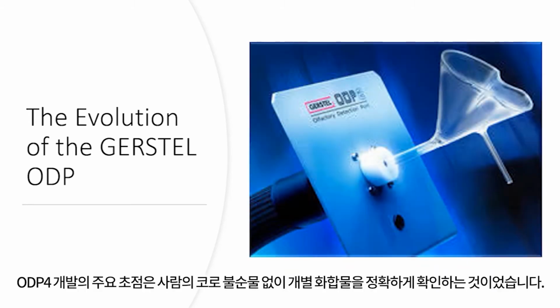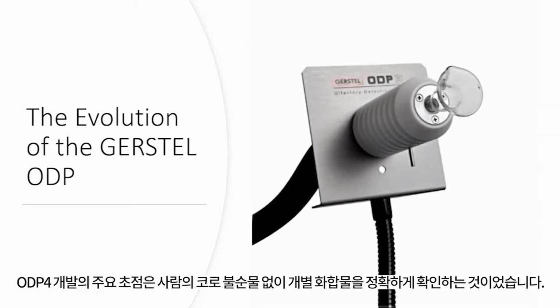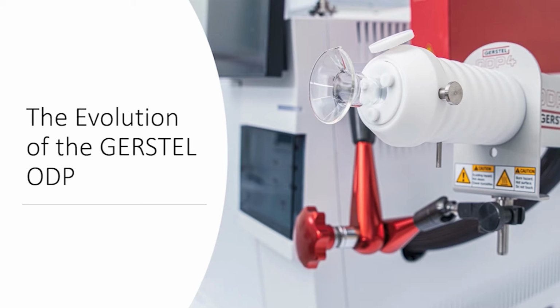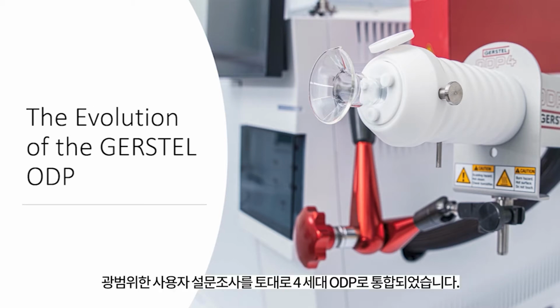The main focus in the development of the ODP4 was the accurate presentation of individual compounds to the human nose, that without adulteration, for best possible identification and determination. It is important to note that extensive user surveys have been incorporated into this 4th generation.